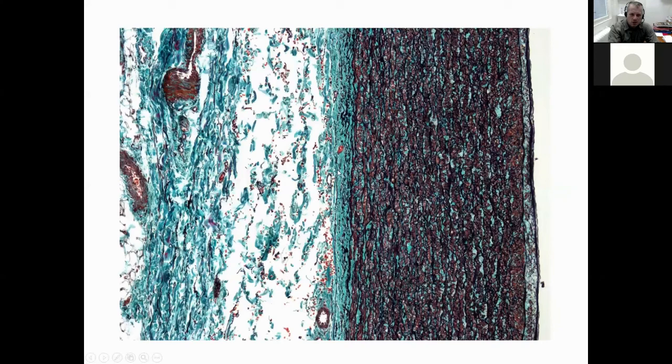You could be asked, is it a muscular or elastic artery? So in this staining, which is a combination of green trichrome, where collagen is green, and a special type of hematoxylin that stains the elastin black, you can see the pattern of repeating black elastic membranes, which is typical for elastic arteries. So your response would be, it's an elastic artery. Then you could be asked to demonstrate some of the vasa vasorum here. These are the blood vessels in the adventitia, right? And the type 1 collagen, that's the green stuff here in the adventitia.